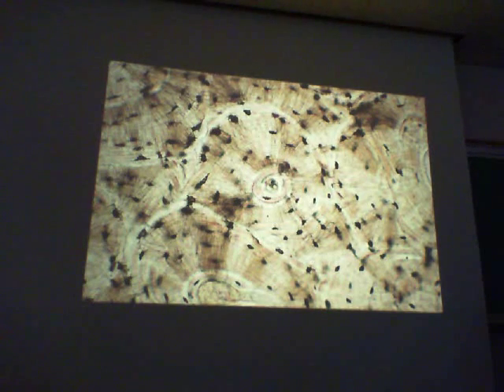One lacuna, several lacunae. And you can see the lamellae going around the circumference of that osteon. So there's an osteon, there's an osteon down there, there's another one over here. So right in here we have more interstitial lamellae. What's another name for osteon? Haversian system.